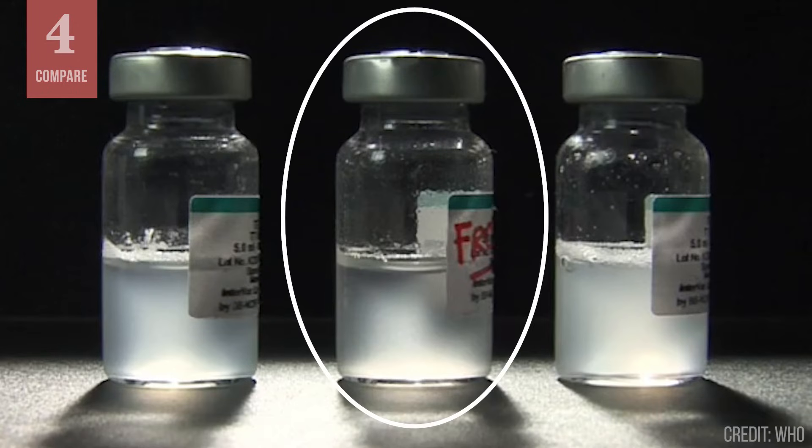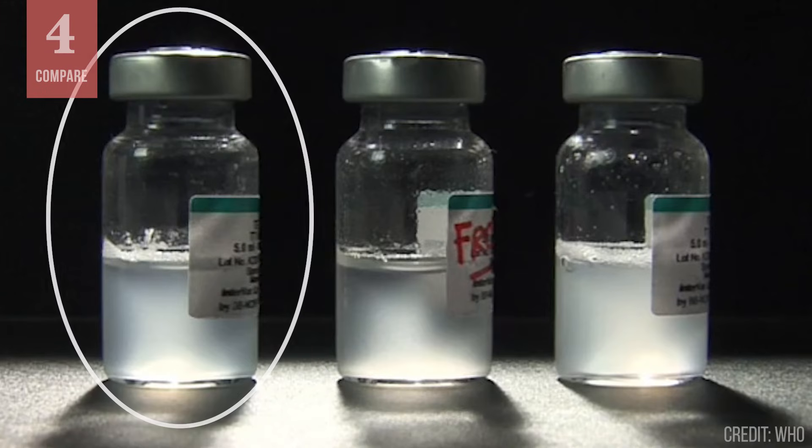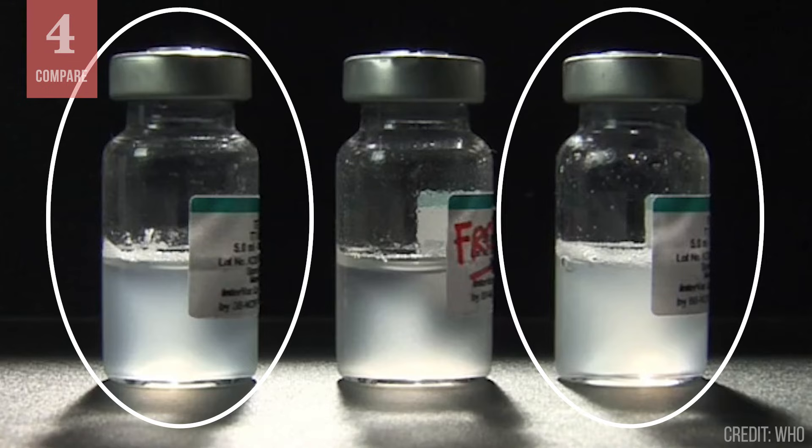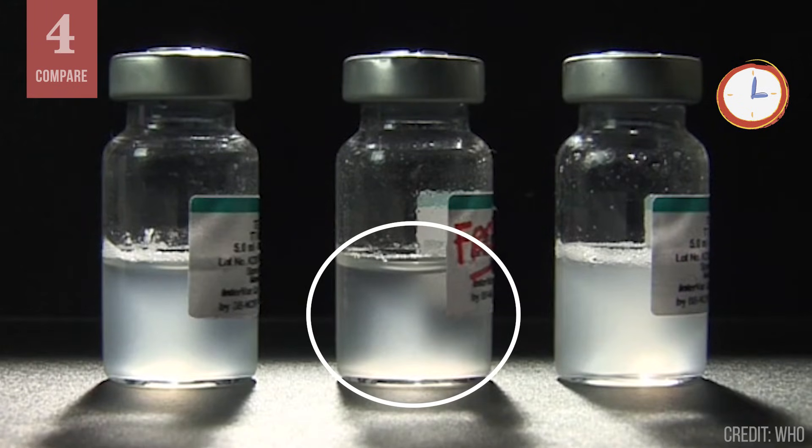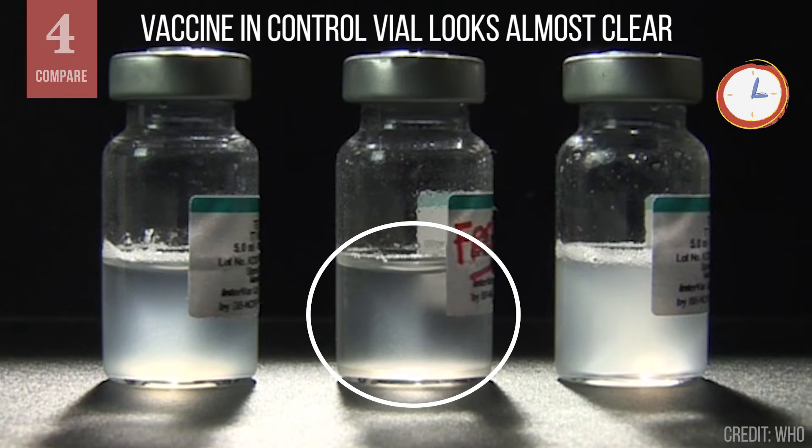The center vial is the control vial that was deliberately frozen. The ones on the left and right are test vials. The shake test takes a few minutes, but we will speed it up to show the results faster. The vaccine in the control vial that you froze will form tiny flakes of sediment that quickly settle at the bottom of the vial. The vaccine will look almost clear.